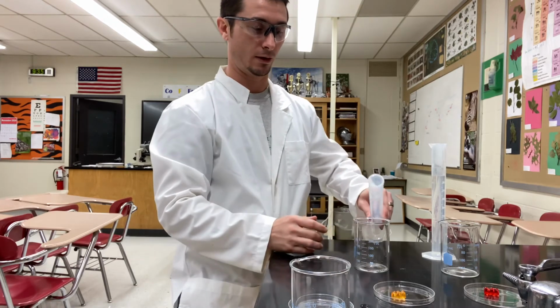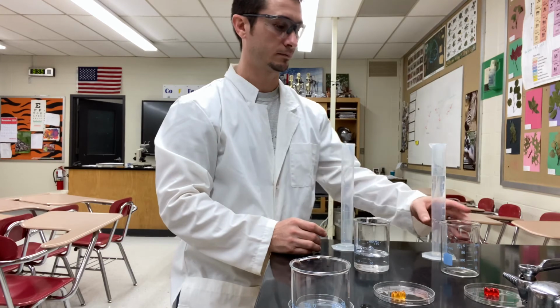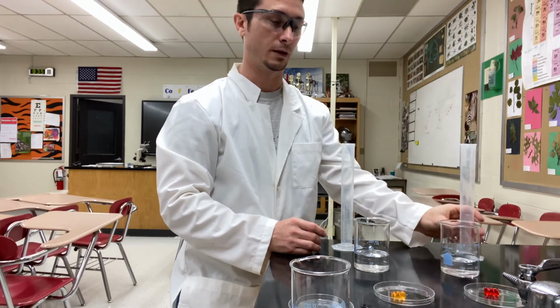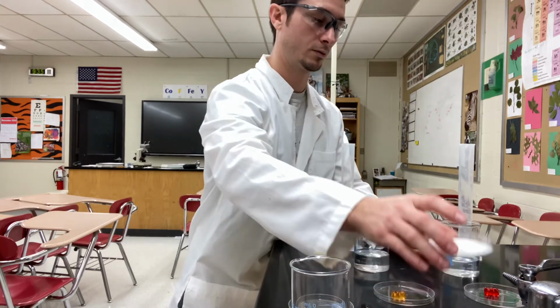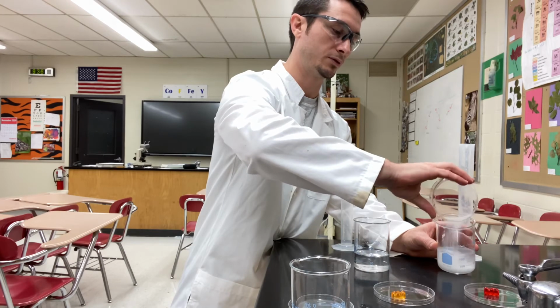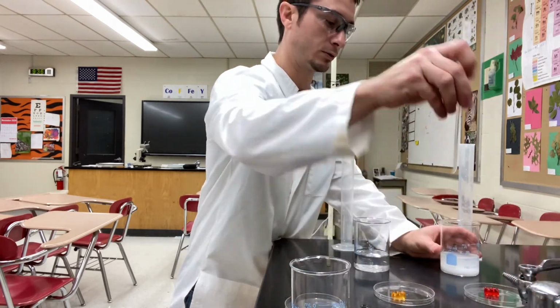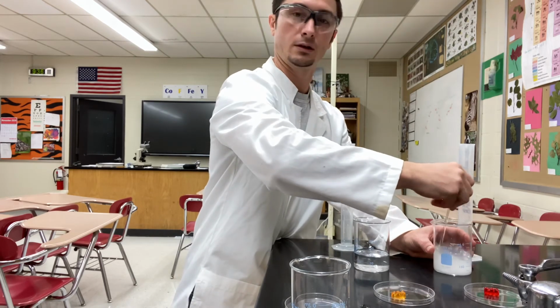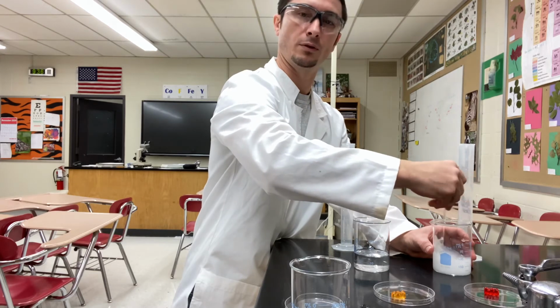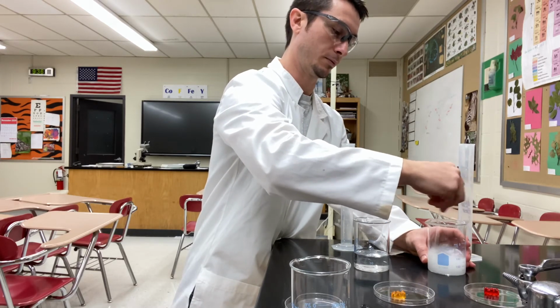The next one, we're going to add our 90 milliliters of water to each one. But in the red gummy bear's case, we're going to add that 32 grams of salt, and we're going to stir it up. We want to make sure it's a uniform solution so that every last bit of this water is the same, that we don't have a bunch of salt sitting at the base of the beaker.